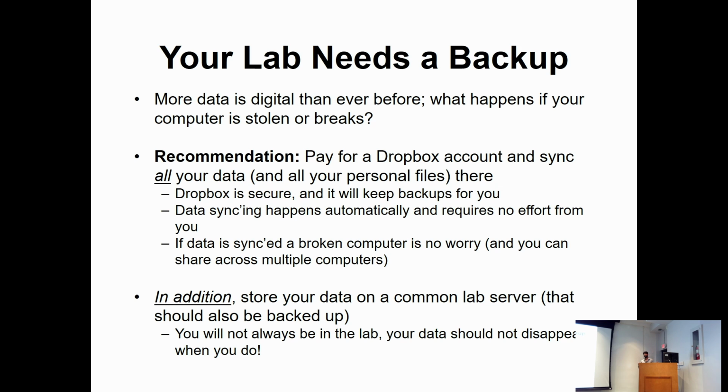And if your computer is broken, we don't need to worry, you can access it from a different computer. There's another thing that our lab does: we have a common lab server. So all the things in the shared folders go to a different computer. So whenever someone leaves, that data is not going to disappear, it's still there.